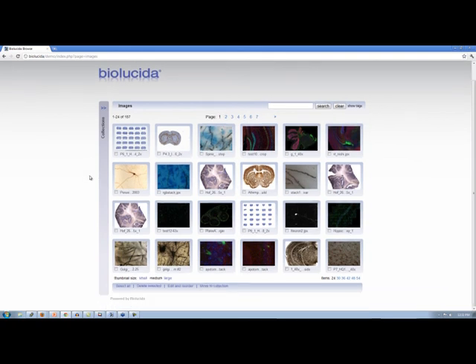Exactly. So as we had said, each of these images belongs to a collection. And now, Jeff, let's just take a moment and define what you mean by a collection. Essentially, collections are arbitrary grouping of images, really. Okay, and I can decide what to make it, right? So I can decide that I can have a collection that's purely my transgenic mouse pictures and another collection that's purely my control mouse pictures. Or I could even say this collection is all fluorescent images, this collection is all bright field images. Exactly. You can organize them as anything that you like.